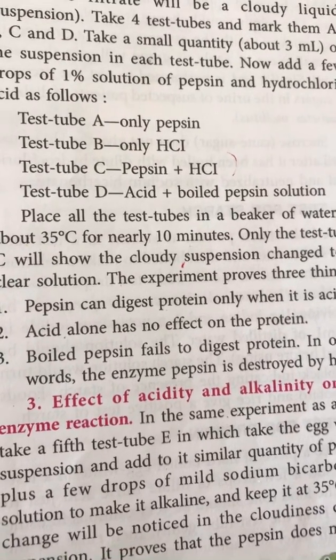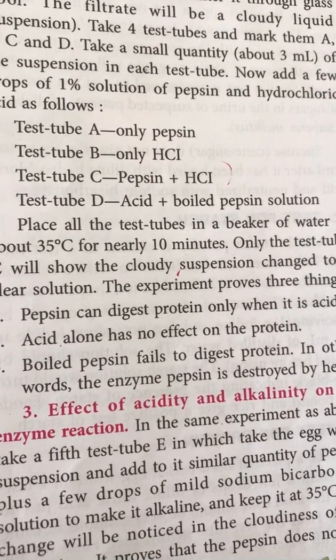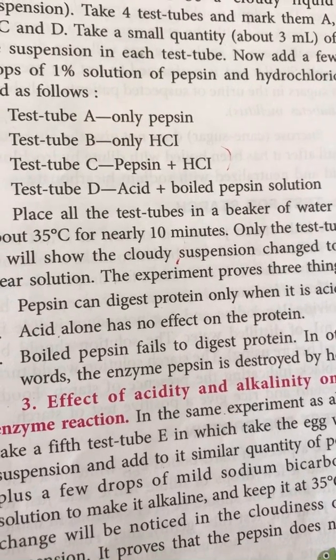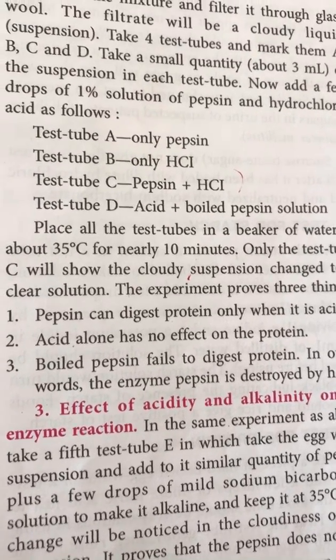Keep the solution at 35 degrees Celsius. No change will be noticed in the cloudiness of the suspension. It proves pepsin does not act in alkaline media.